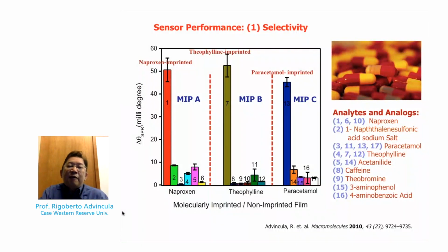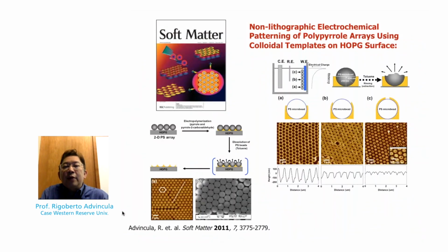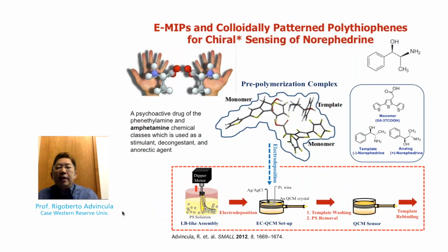Here we have a very high response with surface plasmon spectroscopy based on the presence of the originally templated drugs.